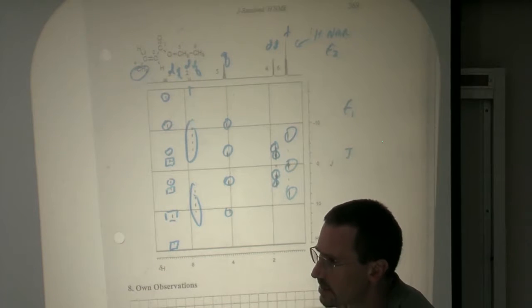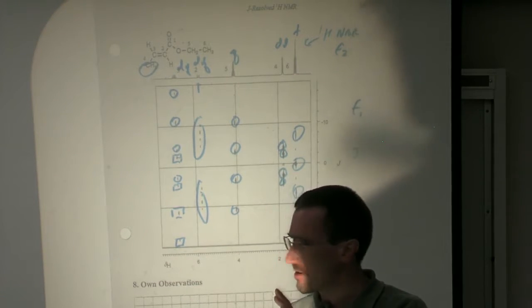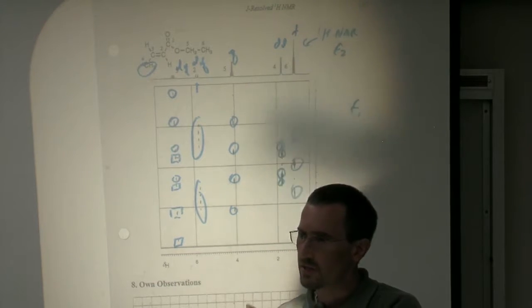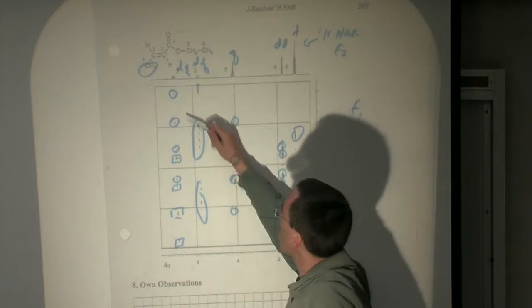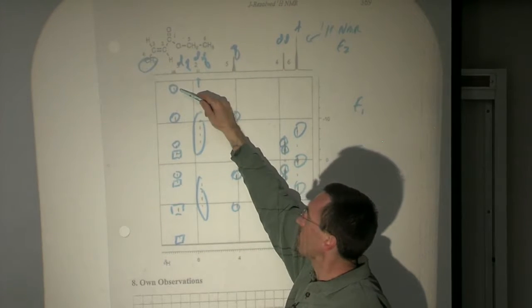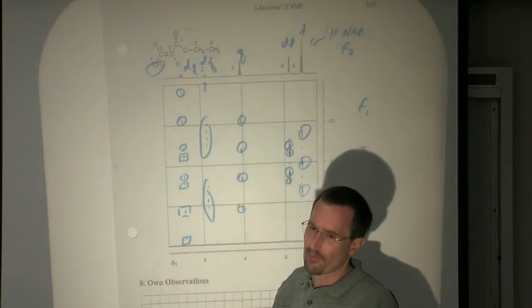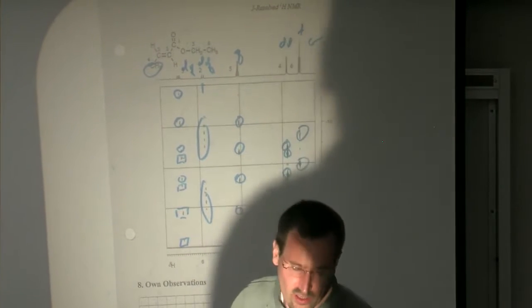This experiment isn't too widely used because in cases where you have really bad overlap, you're still going to have this. In other words, if I had another multiplet right on top of this, you would still end up experiencing the two of them right on top. And so unless they were a little bit separated, you wouldn't necessarily be able to solve anything.